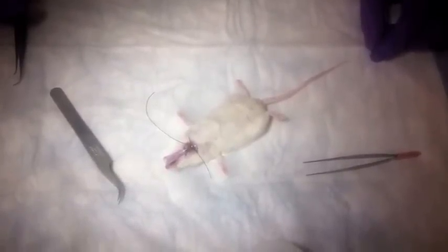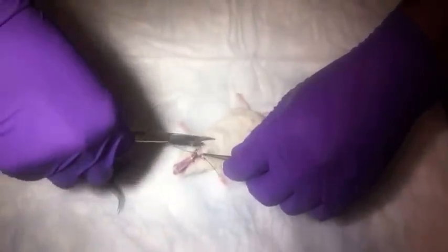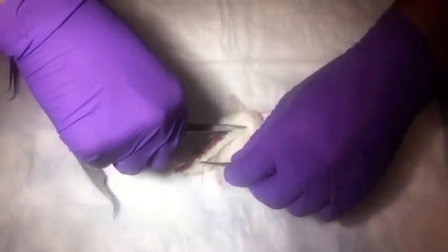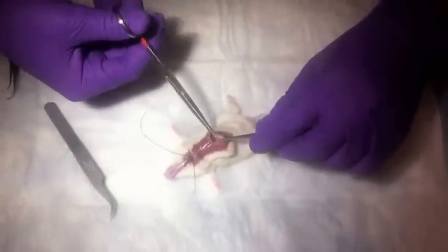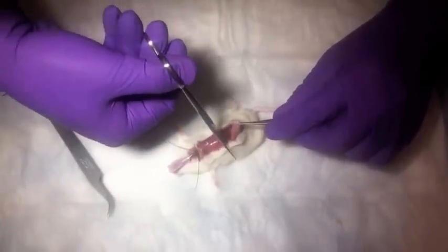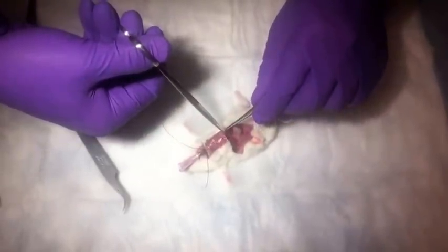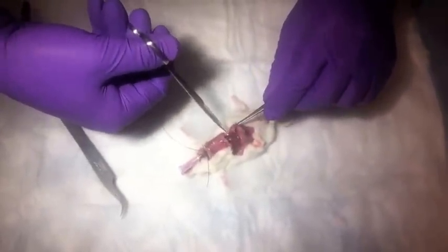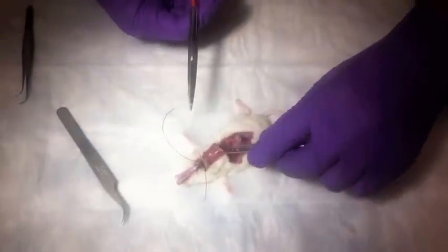We're going to open the thorax so you can watch and ensure that the lungs are inflating with fixative. You can do it with the thorax intact, but occasionally if there's a bubble and one of the lungs doesn't inflate, you can't see that until after you've opened the chest. This way it allows you to see if the lungs are inflating fully.